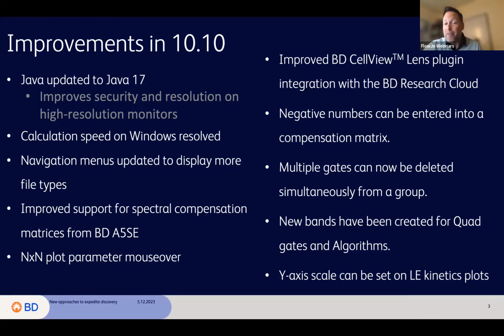We've allowed you to add negative numbers into a compensation matrix. So you could have previously imported negative numbers if you had created a comp matrix that had some negatives, and negatives will tend to happen in small doses. You'll tend to see a negative 0.1 now and then in a comp matrix, just because sometimes there's skew in the way a population is distributed around the mean. And actually fixing the skew with a negative number is what makes the MFIs line up perfectly in traditional compensation. So that happened. Now, if you want, you can actually just type in negative numbers as well.